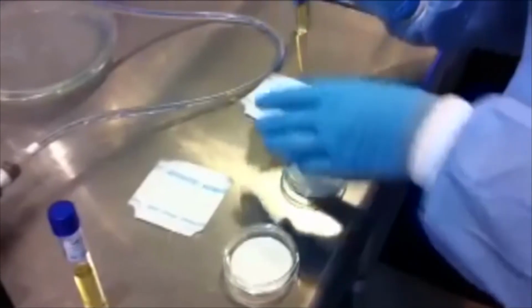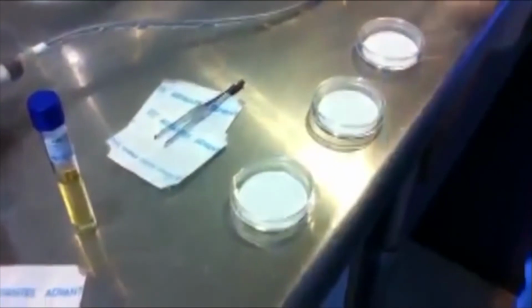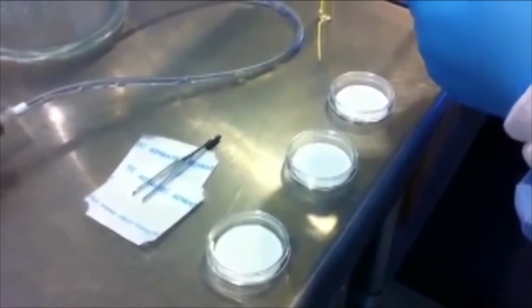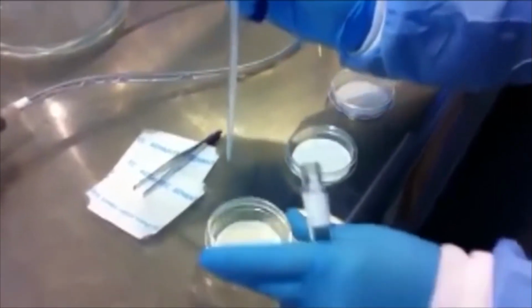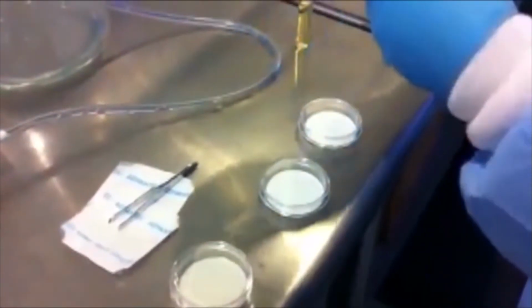Another way to do it would be to put it right onto a pre-poured petri dish. For example, like the universal beer agar plates we make for Miller Coors. In this case, we're going to be saturating the absorbent pad with the media. And then we're going to be placing the membrane filter onto that pad. And once that's done, we can incubate and then count for colonies. Okay. Just enough to soak it.